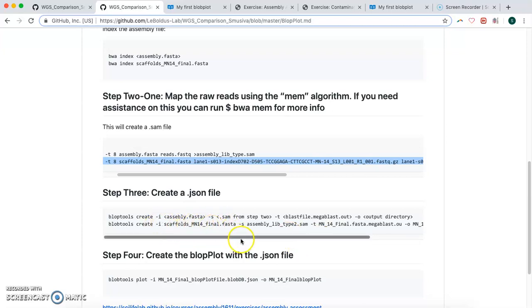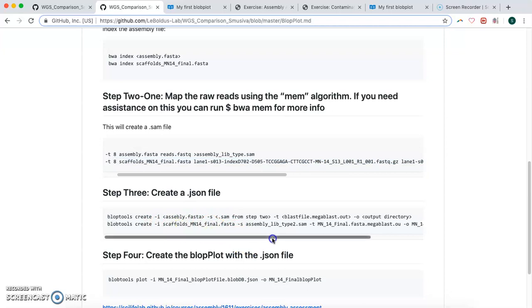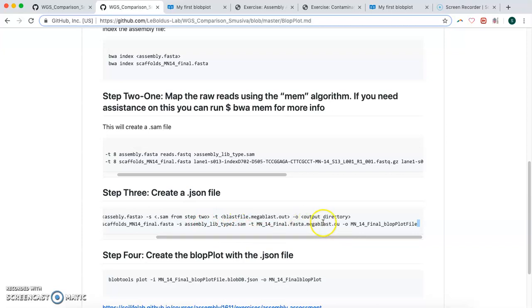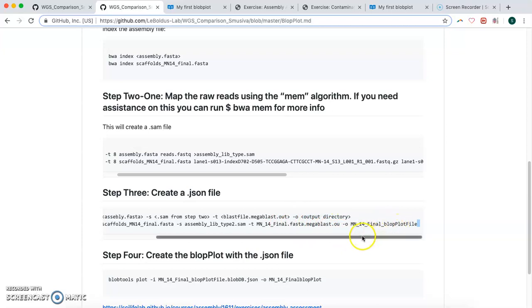But we take our assembly file, and this is the name of the .sam file we want. And this is our BLAST file, and this will be our plot file.